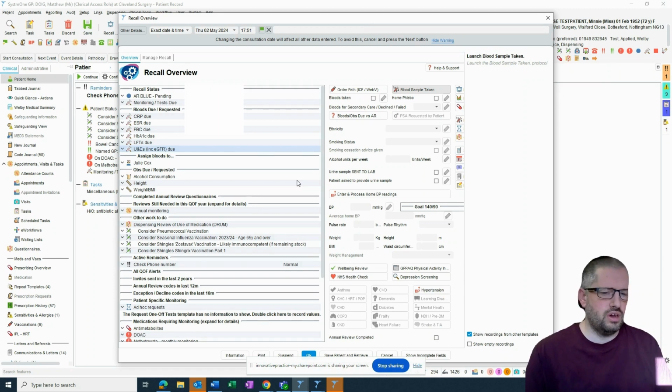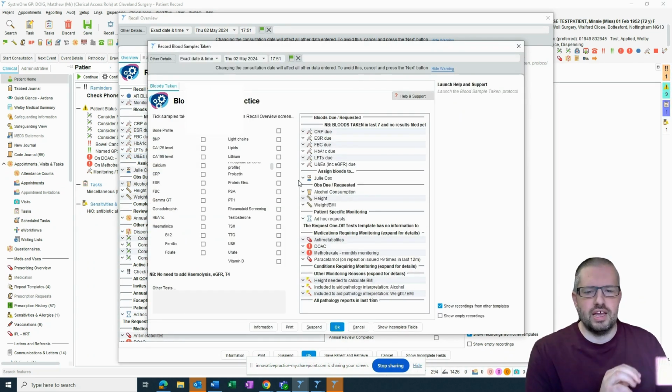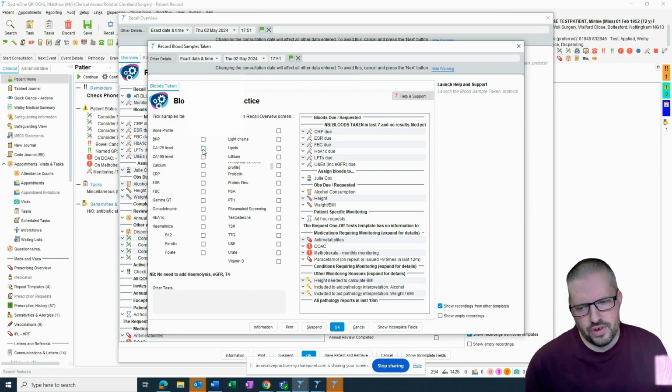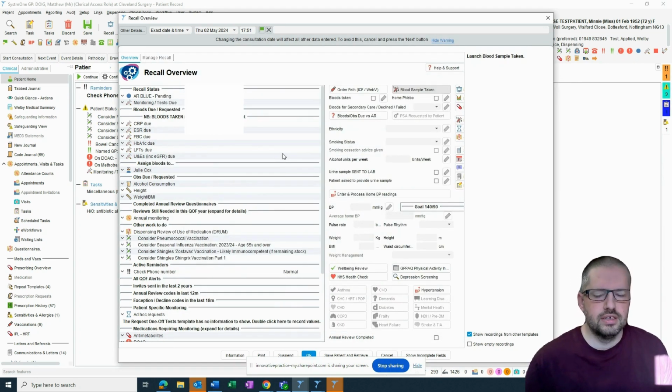So it's going to code that I've taken a blood sample, that there's consent, aseptic technique, things like that. So here we can see the list of bloods that the system's already recording. There's no need to add those in. There's also no need to add in things like EGFR or T4 or things that would just be part of that blood test. But say, for example, I don't know, CA125 is being done as well. If I OK that, I can also free text in there ones that aren't in that list.